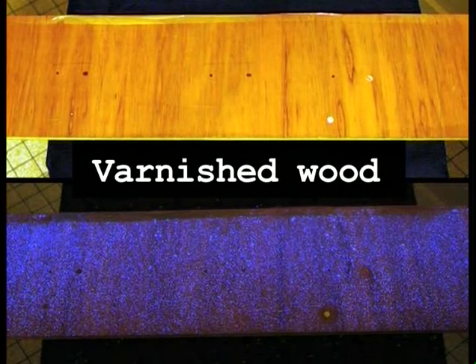I don't know a medium today that is not suitable for Bluestar forensic. Yes, so carpets, clothes, all of these are suitable? All types of medium. The only difficulty will be varnished wood, as we said, and then not all varnishes. Only some varnishes produce a false positive.